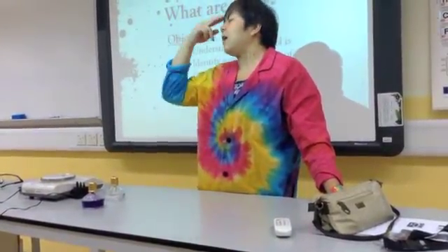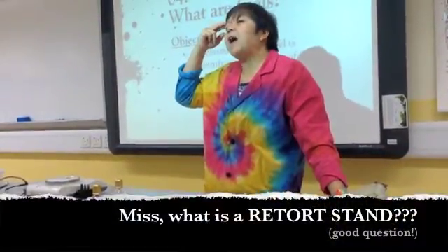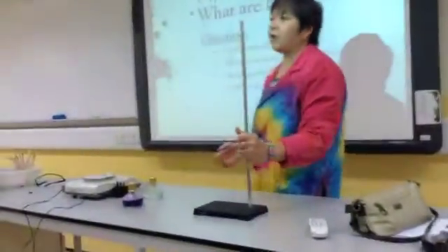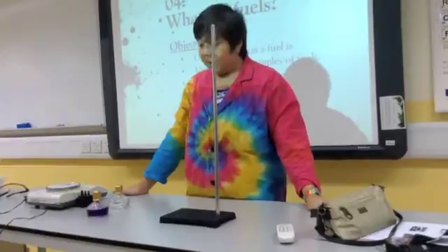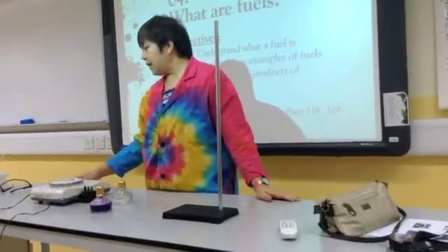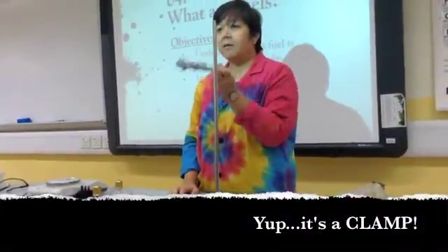Now I know what you're probably saying: that is a retort stand. This is a retort stand. Now, using a retort stand you need to attach a clamp. This is a clamp.